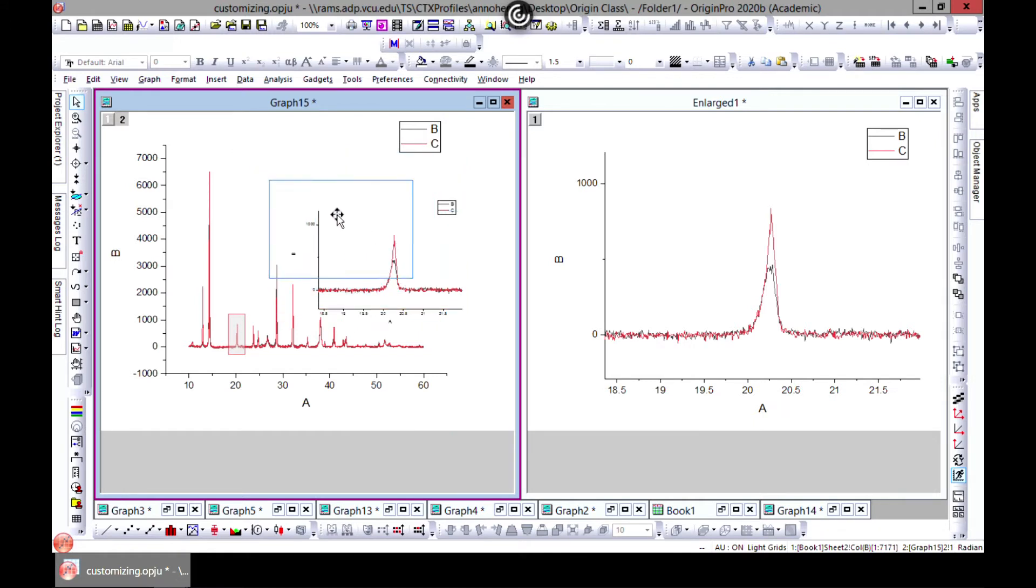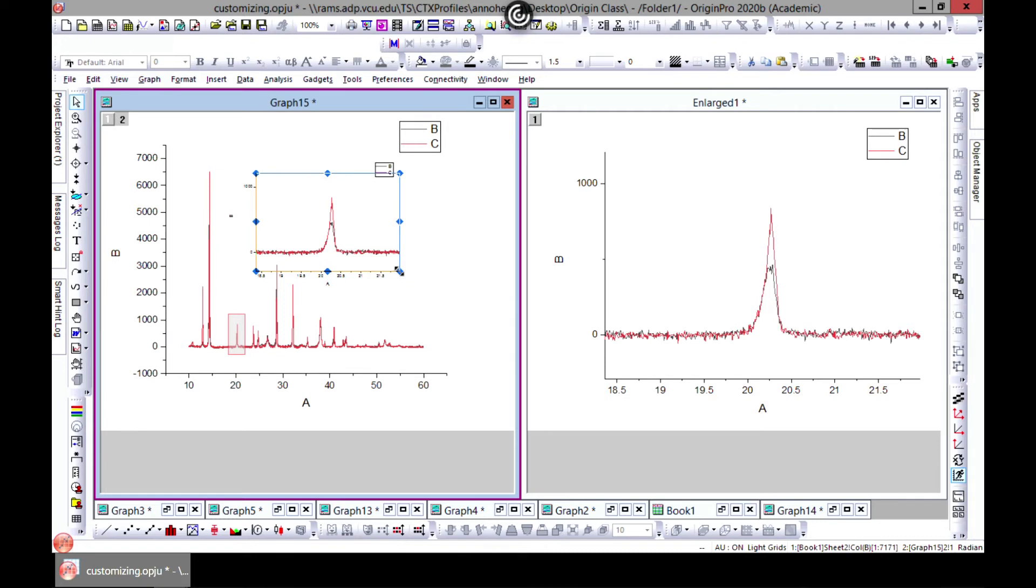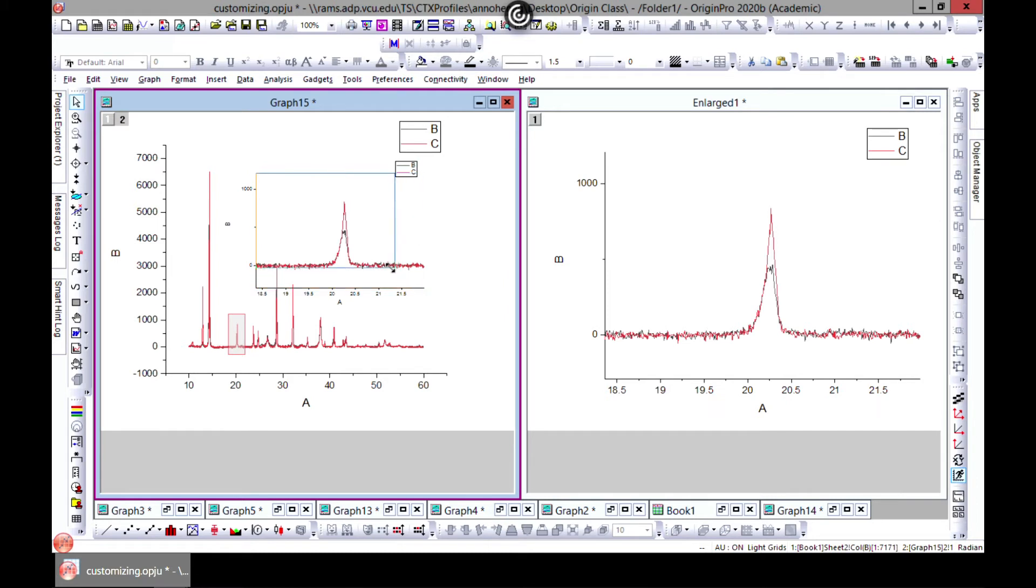There you go. And if when you're zooming out, if you want to keep everything, you just hit Ctrl and still zoom out and keep everything that you have.